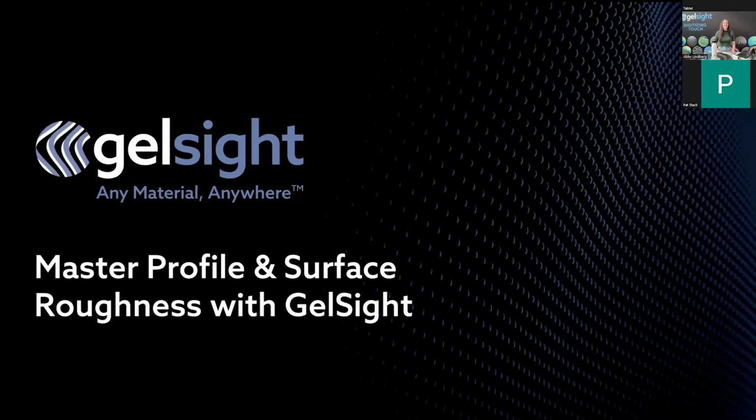I'm Abby Lindberg. I lead GelSight's applications engineering team. I'm here at our headquarters in Waltham, Massachusetts, right outside of Boston. And with us remotely, we have Pat Stack, our principal software engineer and resident surface texture expert. Pat has over 25 years of experience writing surface metrology software and is a former member of the ASME B46 Standard Committee on surface texture classification.